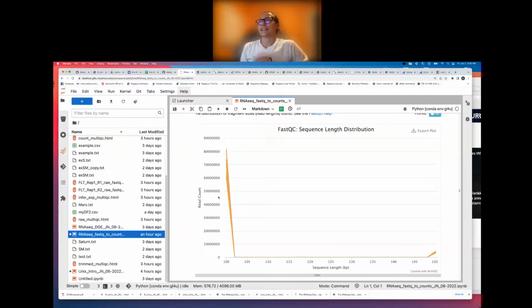But it turns out that they added it with another group's samples, and the other group's samples were sequenced at 150 base pairs long, and they just kind of added our samples onto that sequencing run and gave us back our data, and the additional reads that they had added were 150 base pairs instead of 100 base pairs. So, no, that's no problem, Mark. I'm glad questions are good.